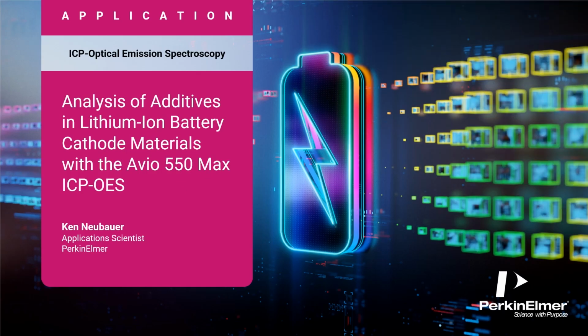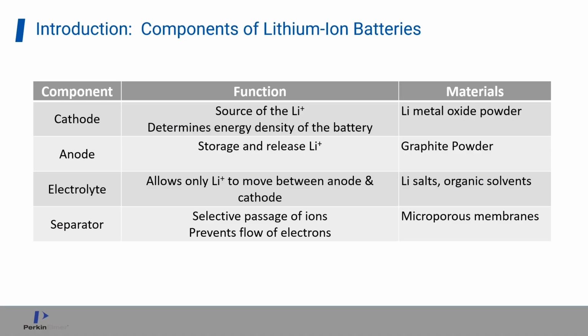Thank you for the introduction. My name is Ken Neubauer and I'm an Application Scientist with PerkinElmer. Today I'll be talking about the analysis of additives in lithium-ion battery cathode materials using ICP-OES.